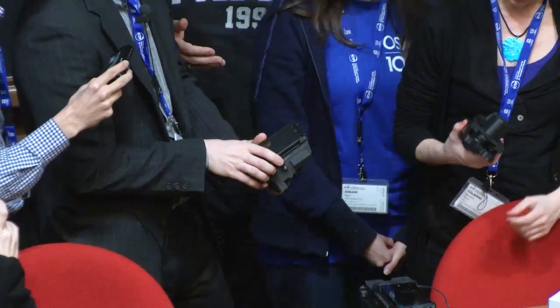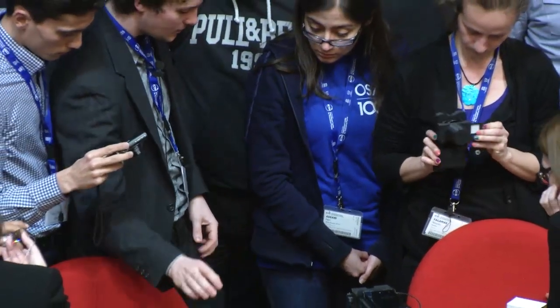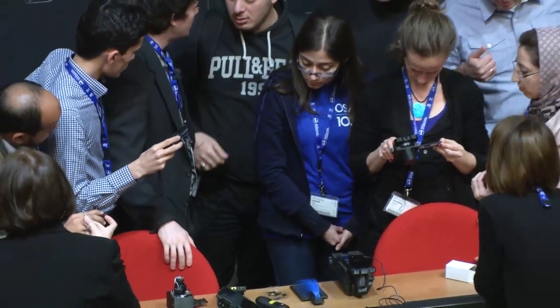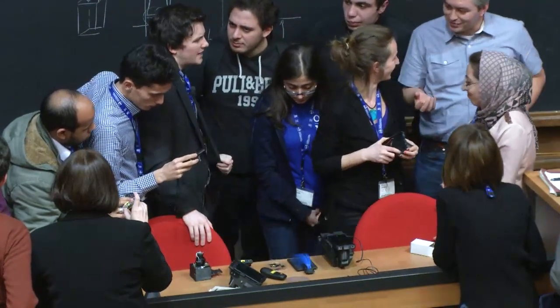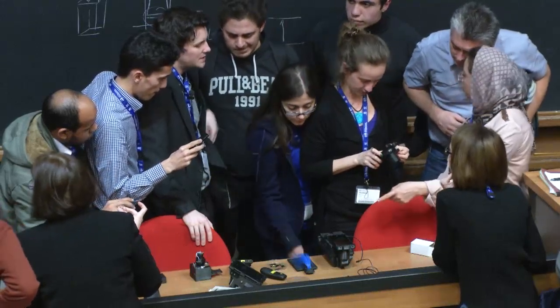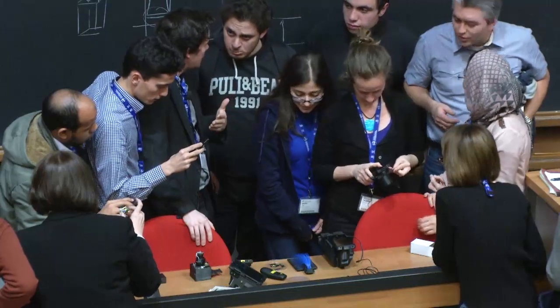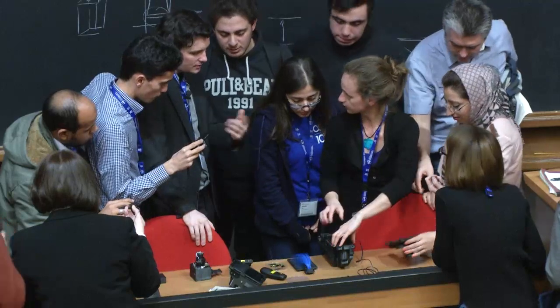The labeling is done by a fluorescent dye. So the fluorescent light inside the sample itself labels inside the device? No. The labeling is outside. The labeling is done before. The dye is called Yo-Yo 1. There are common dyes for DNA. I've never done a DNA labeling process, but it's very common in labs. So as long as you have the reagents, you can go ahead.